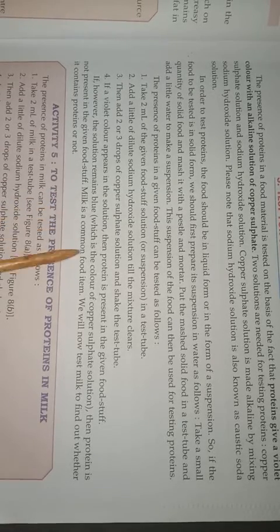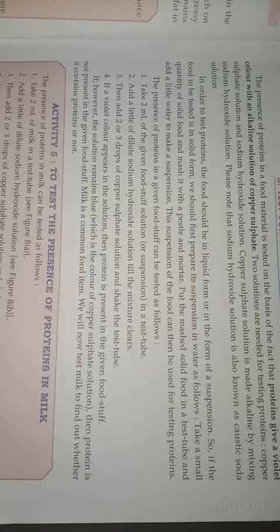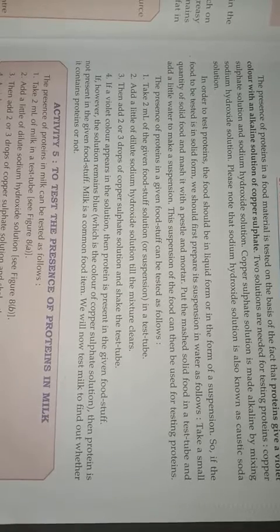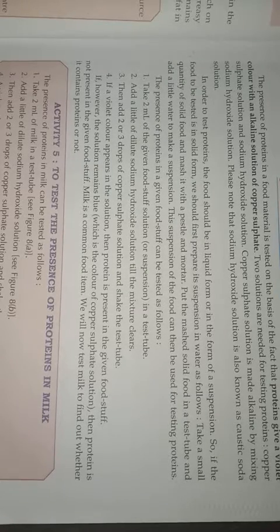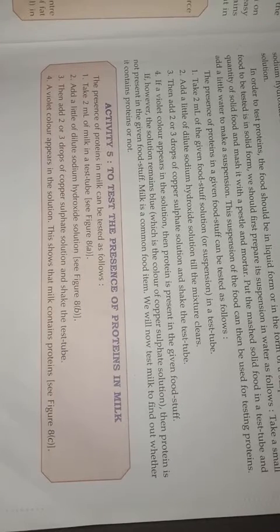Milk is a common food item that you can use for the test of protein. Is it present there or not? Here is an activity given. How can you test whether milk contains protein or not? Let's have a look at it. What you have to do? Take 2 ml of milk in a test tube.